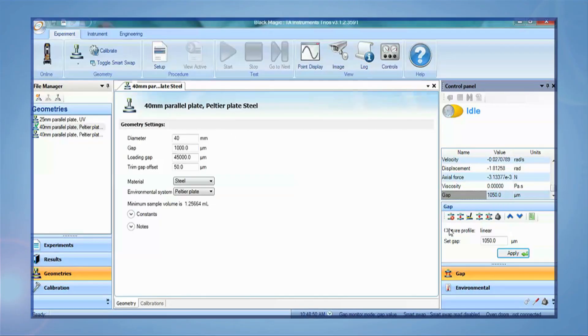With parallel plates it is possible to change the gap and reduce the volume underneath the geometry so the loaded sample volume is filled in the gap correctly.